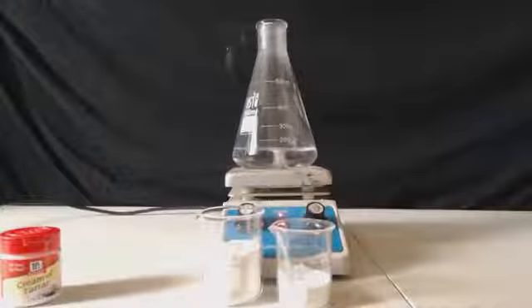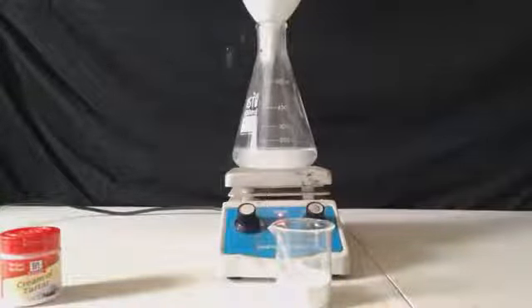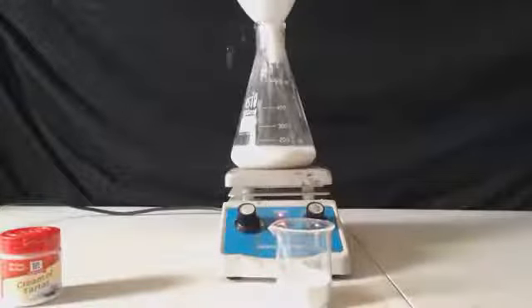I have a little bit over 100 milliliters of boiled water in there, and I'm going to make sure that it stays hot. And I'm going to add this cream of tartar. As you can see, it's not very soluble. That's why I have to have the water heated up. Hardly anything will dissolve.